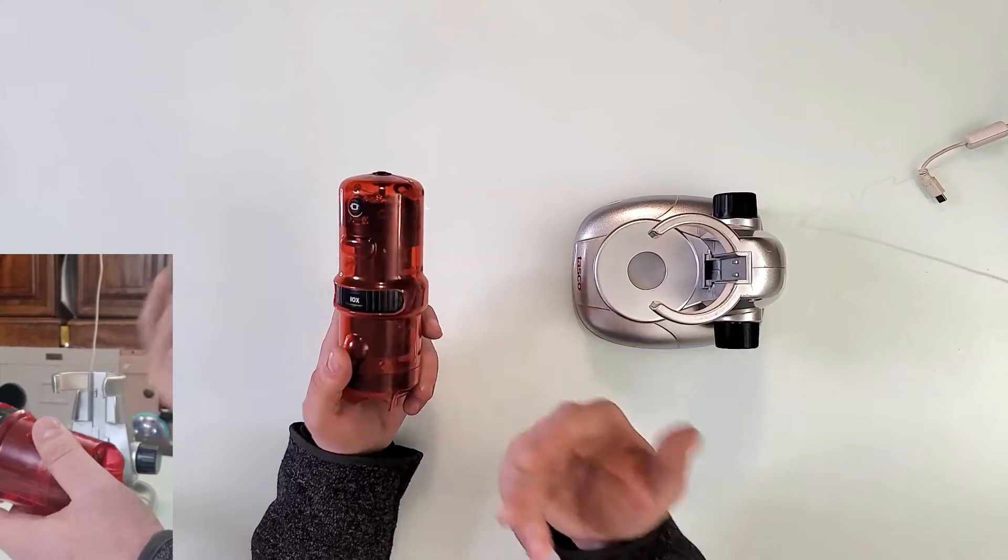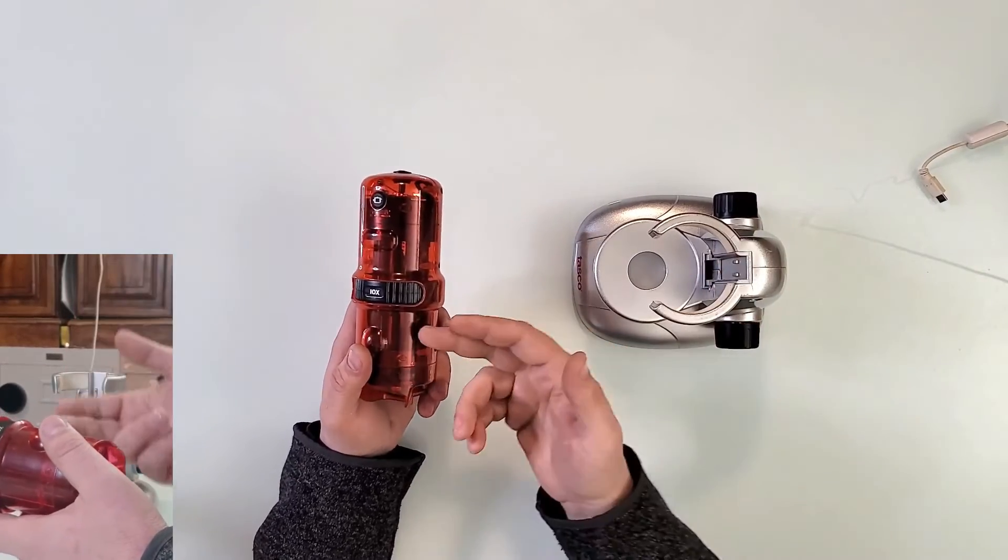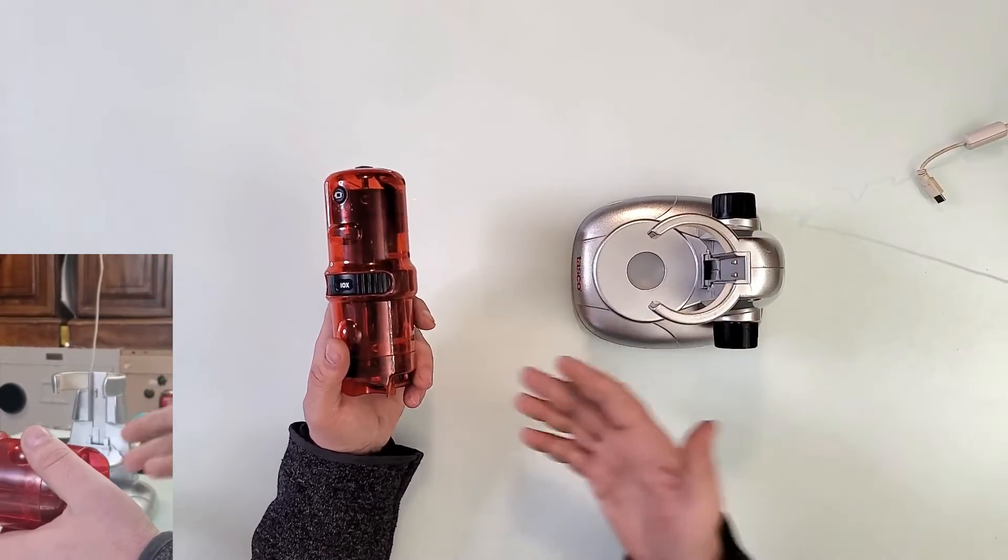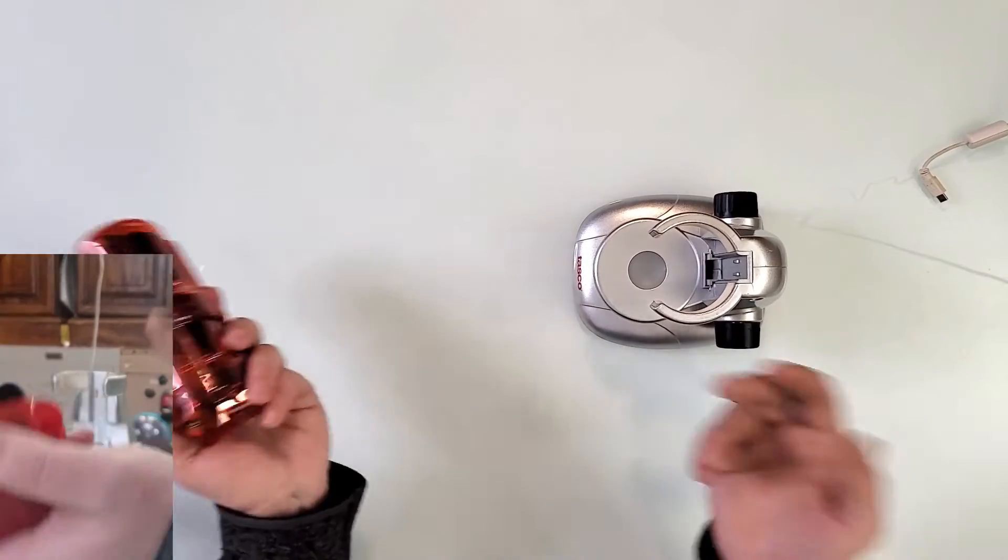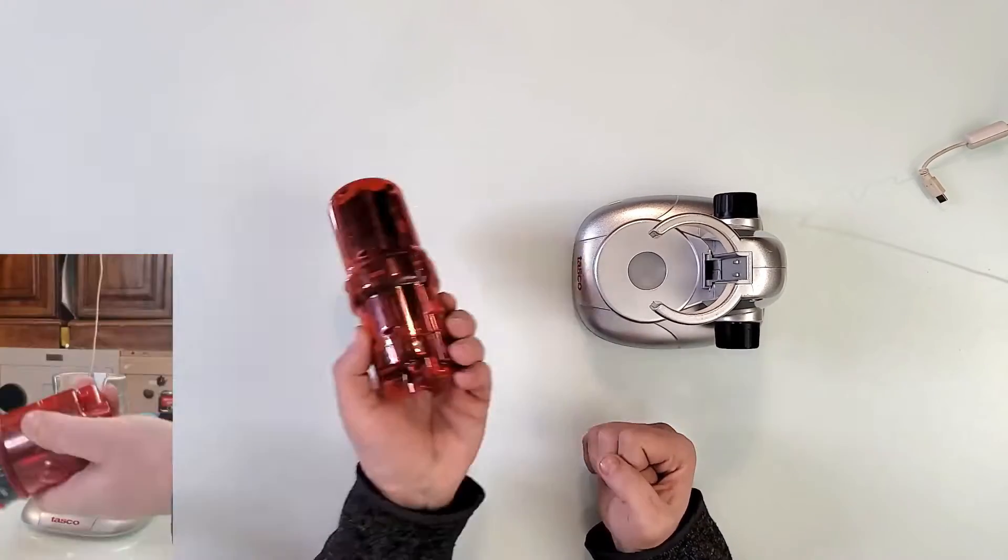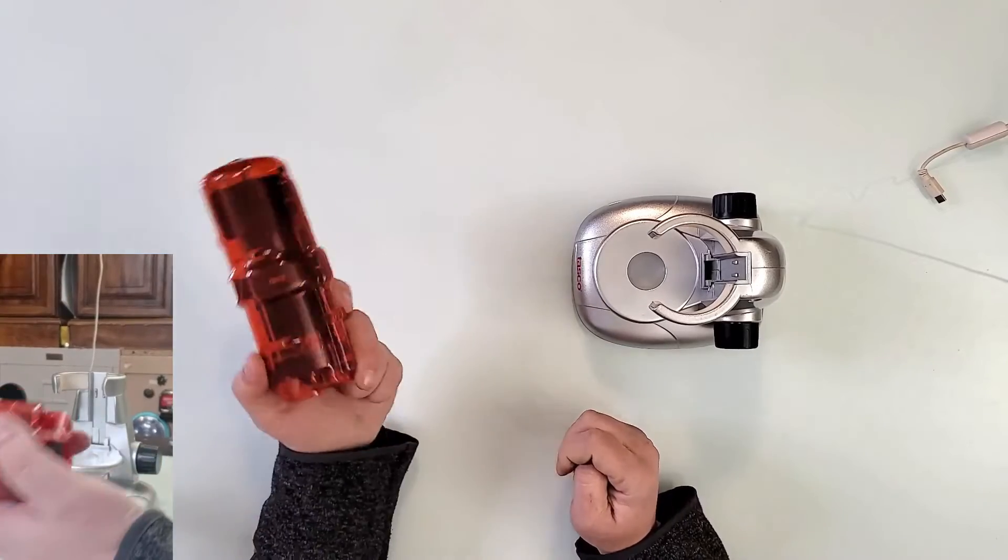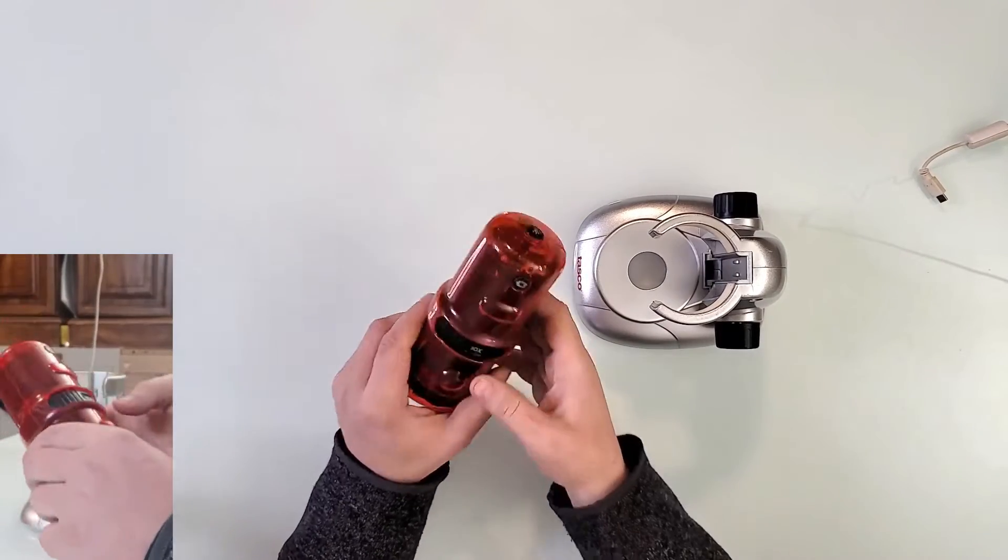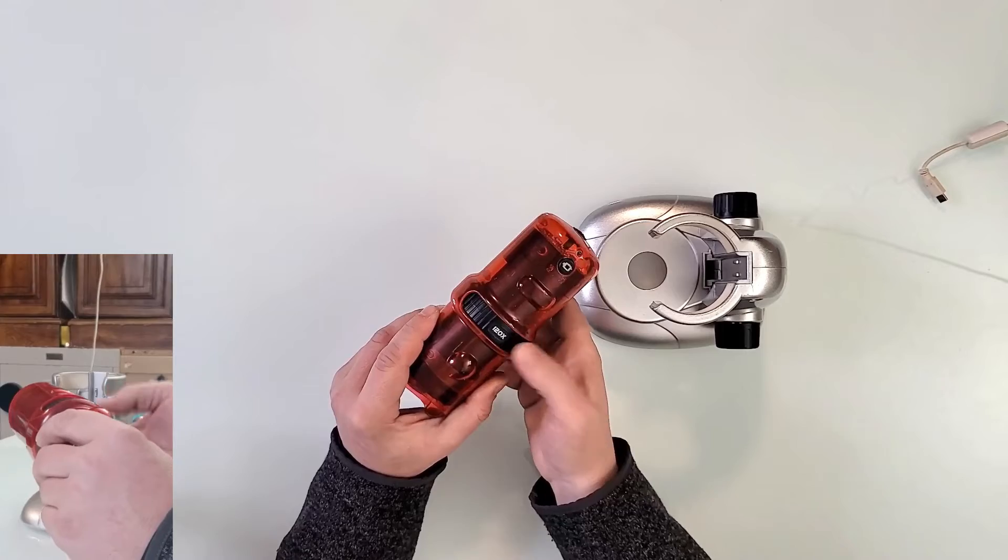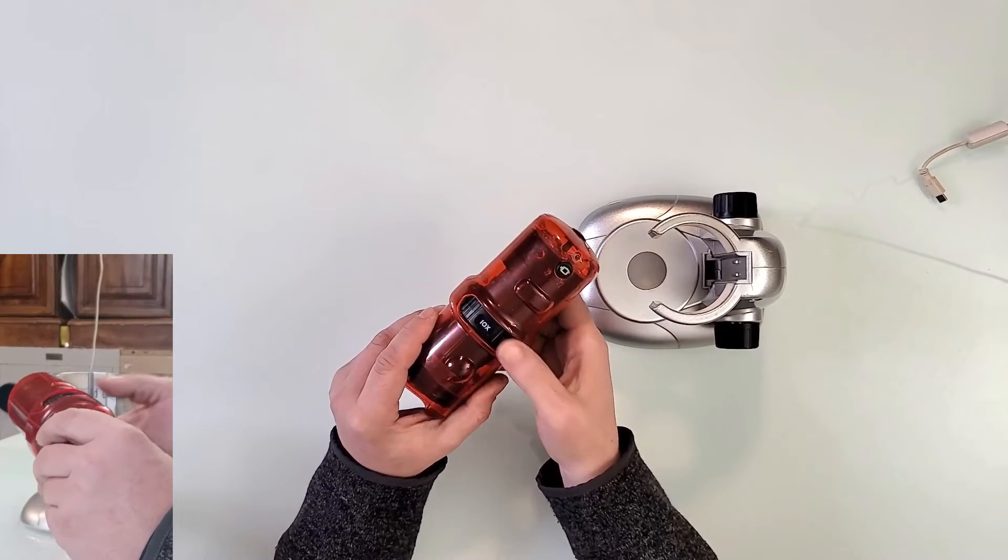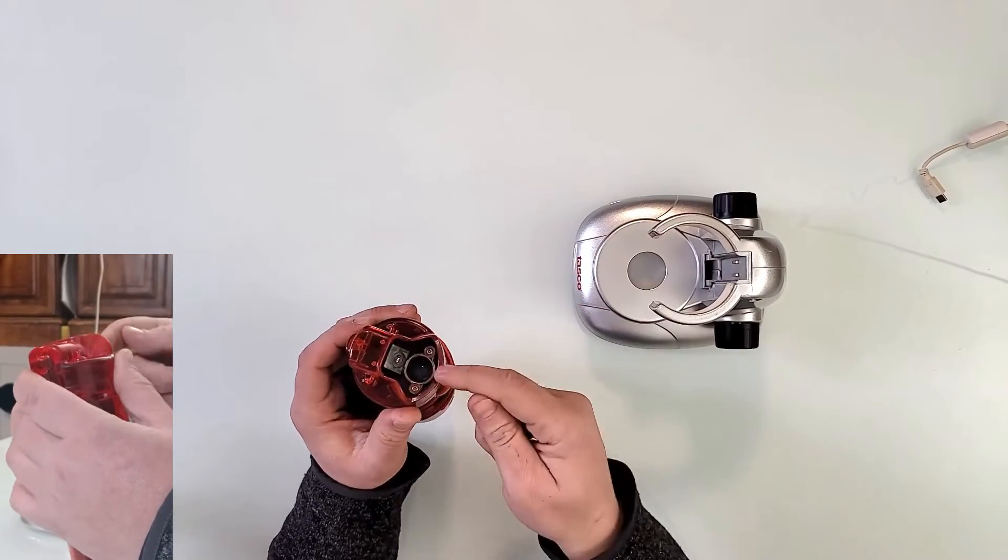This has been around for quite a while. Some people call it traveler microscope, some people think it's a toy, but it can actually be used for more than a toy. It's called Avio Cheetah 3, USB 2.0, has 10x zoom, 60x zoom, and 120x zoom. You can take pictures and video with it. It has a light.